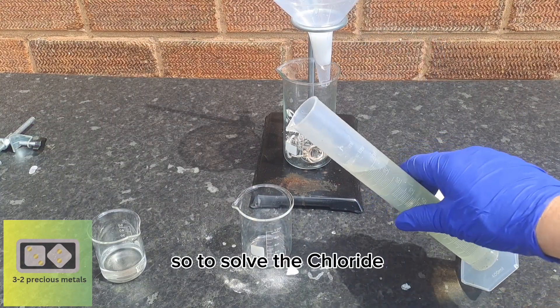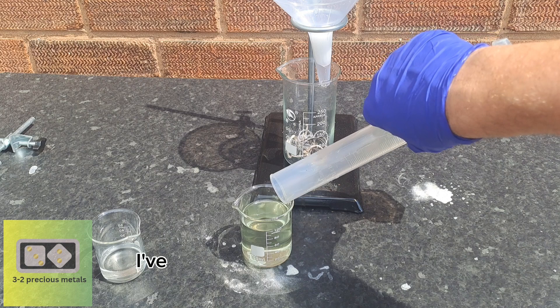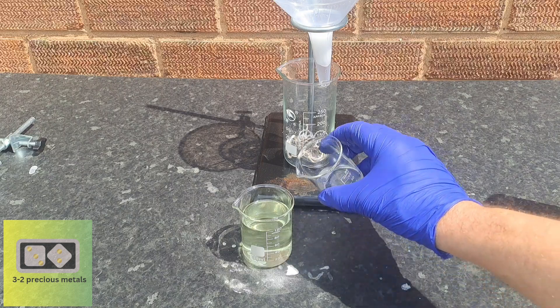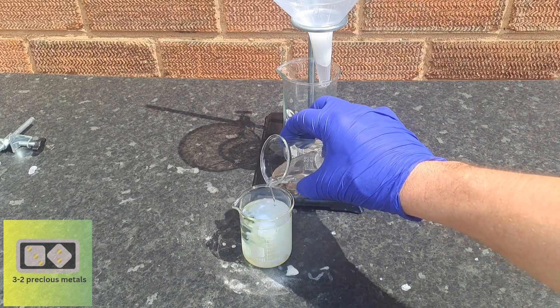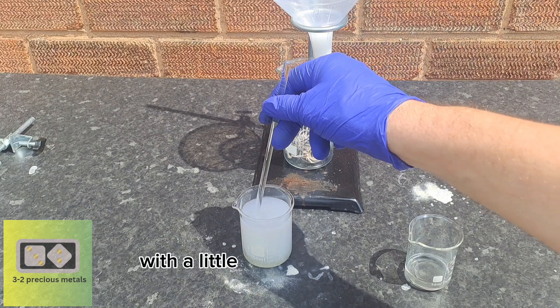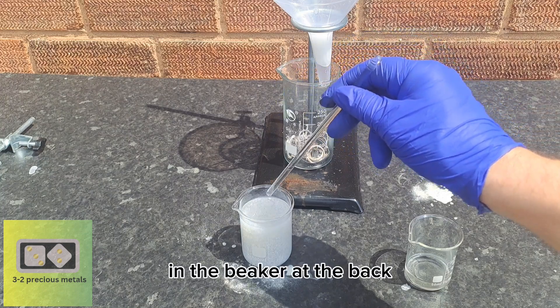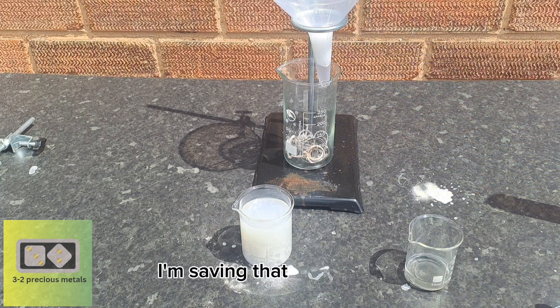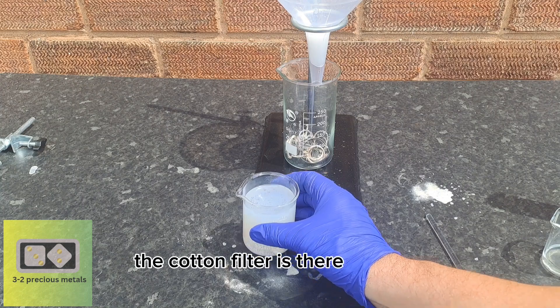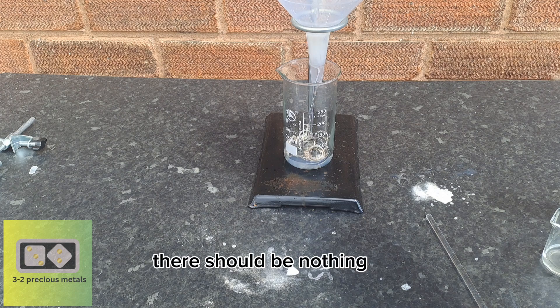To solve the chloride problem, I've taken the 100ml of dilute acid from the graduated cylinder and put it into a small glass beaker. I've mixed 5g of silver nitrate powder in 20ml of distilled water in a smaller beaker. When I pour it into the acid, silver chloride forms. Once all the silver chloride has precipitated out, I'm left with clean nitric acid with a little leftover silver nitrate — which does not harm the acid. Above the beaker is a funnel with a cotton filter to catch all the silver chloride. As the solution passes through, there should be nothing but clean nitric acid.